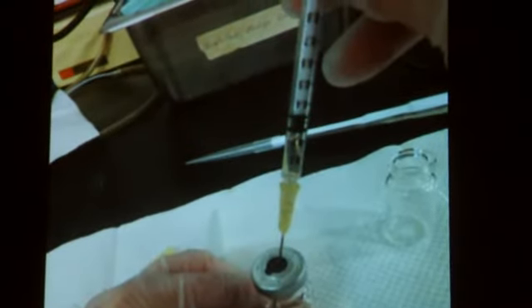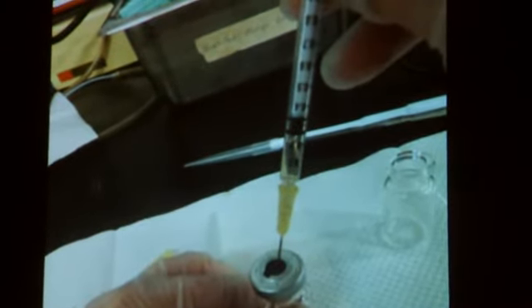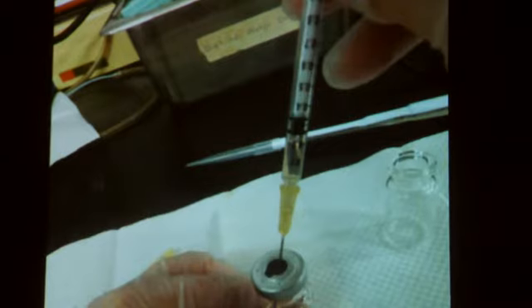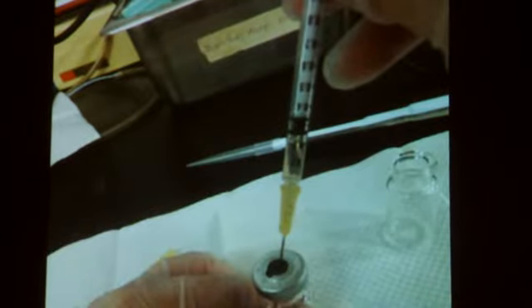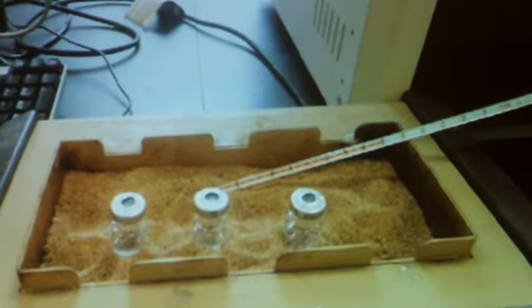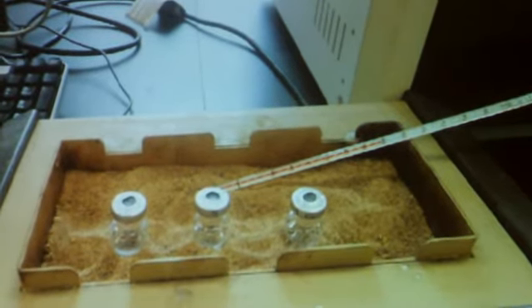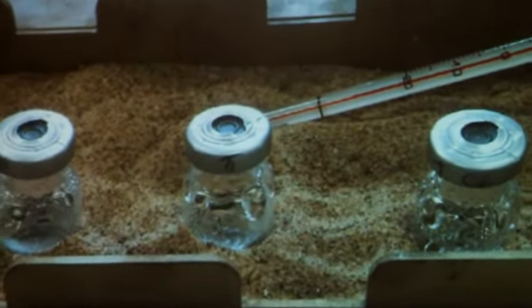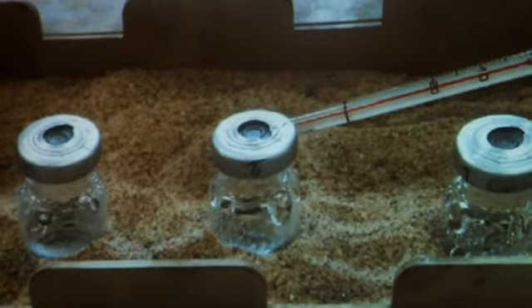Okay. And then later in the experiment, we'll need 125 microliters of TCPP cobalt, and that will be injected into only one of the tubes, the third one. And so we will just be directly poking it through the lid of the bottle, just like we did with the titanium citrate. And we want to place all 3 of these vials into a sand bath at 35 degrees. And just make sure the liquid is all covered by the sand. We want to keep the temperature constant.